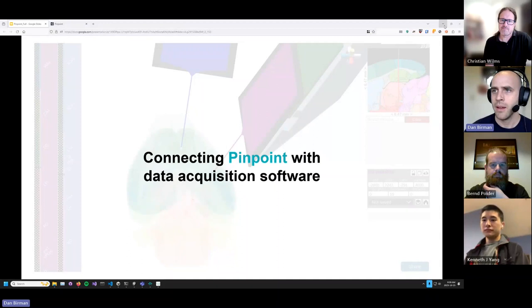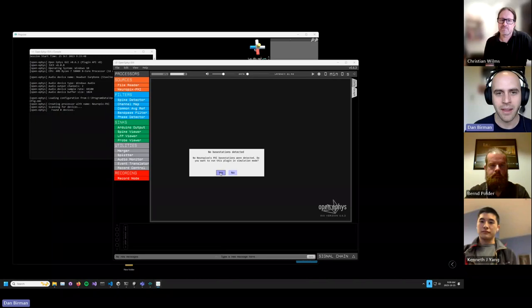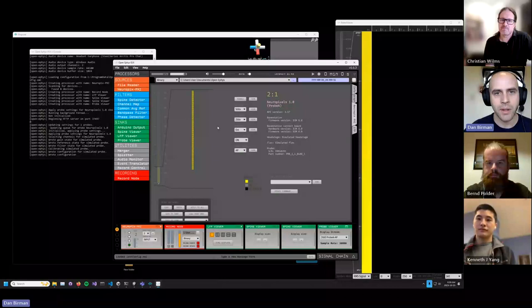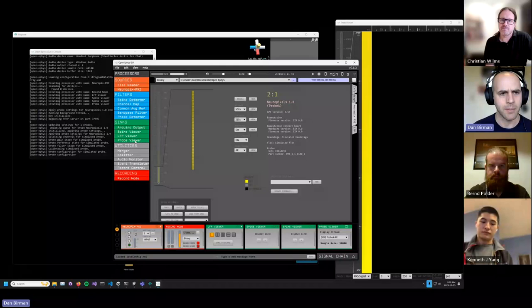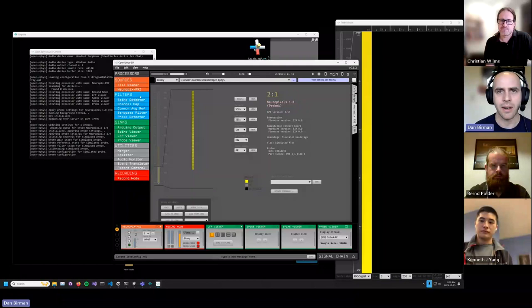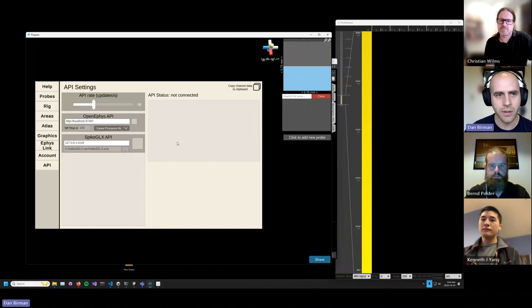I have the OpenEphys GUI running here. I'm going to run it in simulation mode since I don't have any Neuropixels plugged in. I'll put a Neuropixels 1.0 probe in here. The processor you need is the Probe Viewer processor, which you should have if you're running the latest OpenEphys GUI. Once this is set up and you have your Probe Viewer dropped in, you can head back to Pinpoint and go into the settings. There's an API tab down here, and one of the options is the OpenEphys API — you turn it on, and it connects to a server that OpenEphys is running.